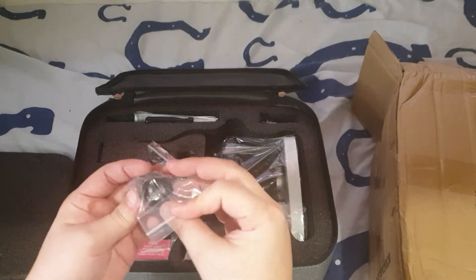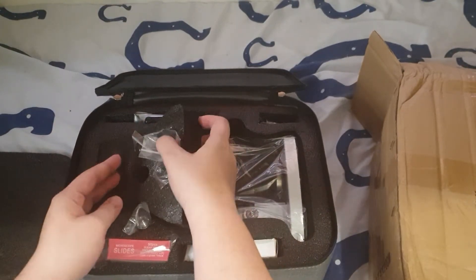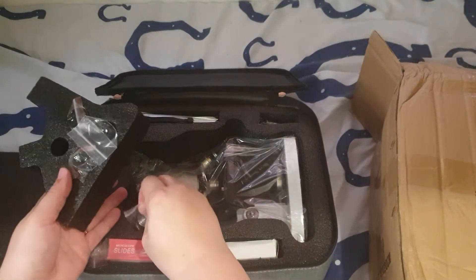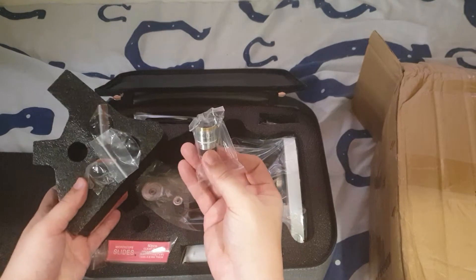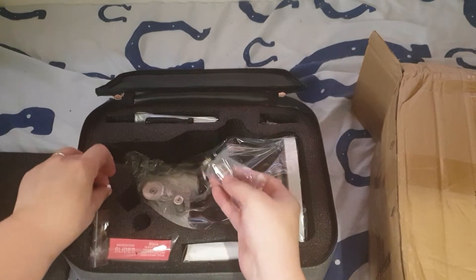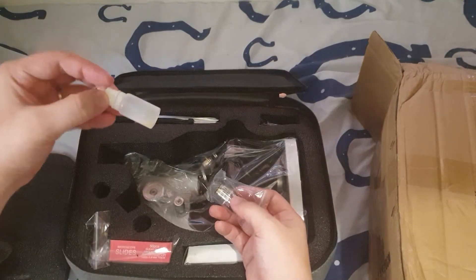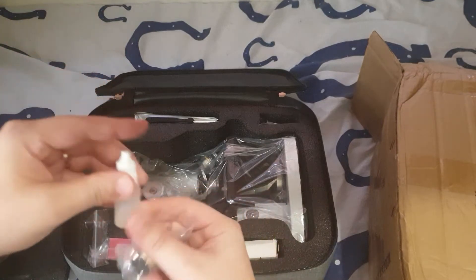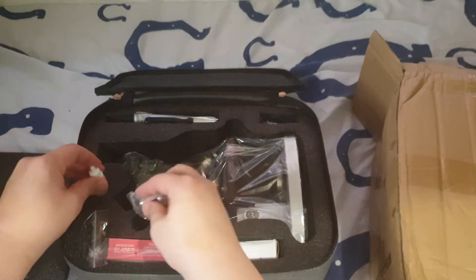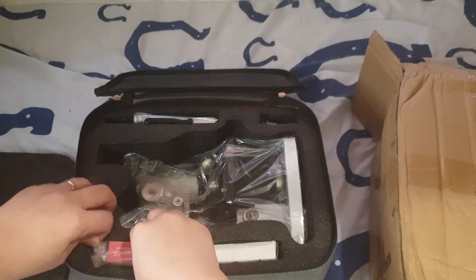So what do we have here? These are eyepieces — looks like there's room for one more eyepiece. You've got the objective; this is the 100x objective. Those are the lenses. This is the oil — I believe this is an oil objective, so you need oil here. I'm not sure how that works; I have never used one of those, but I'll figure that out.